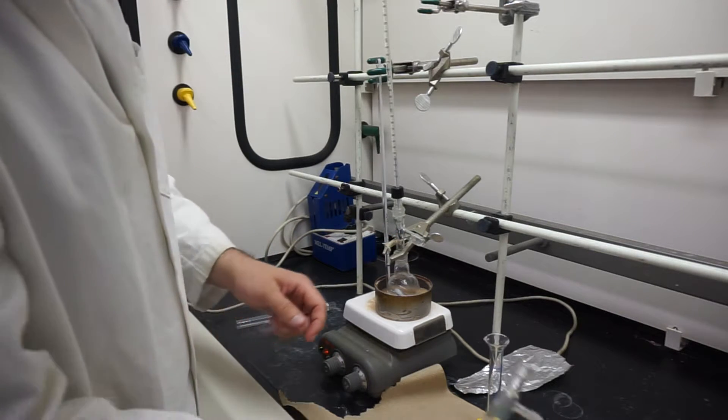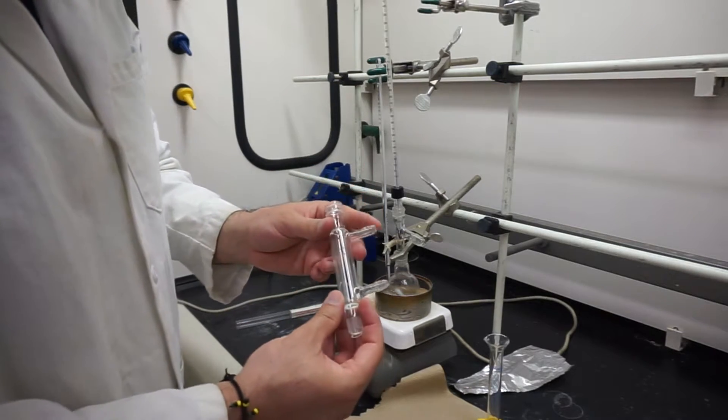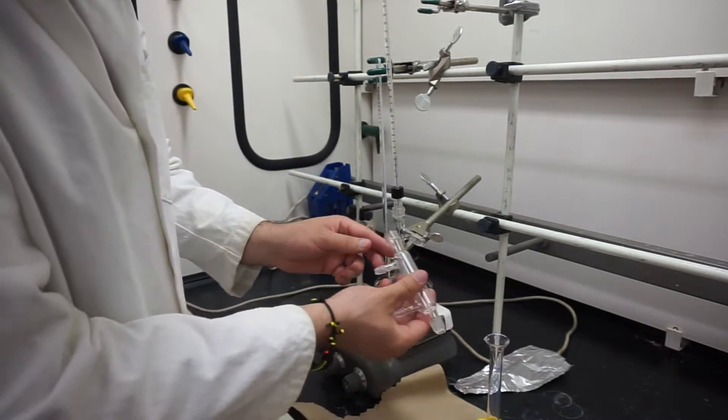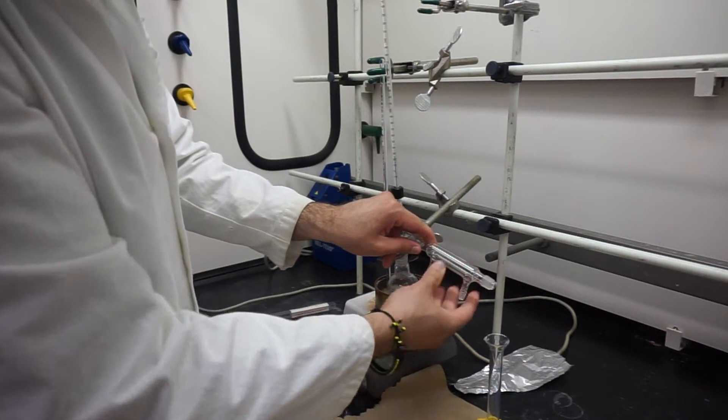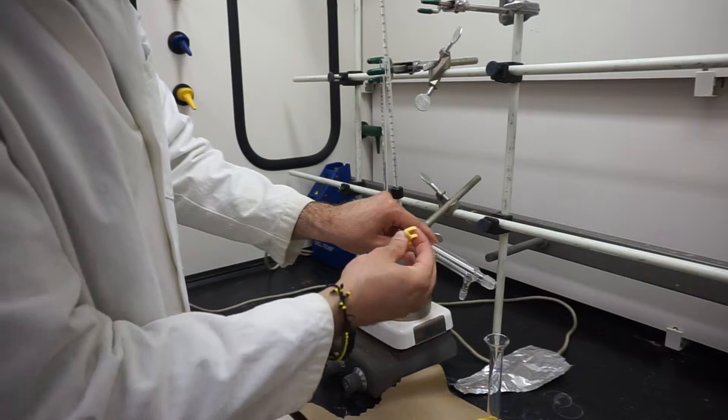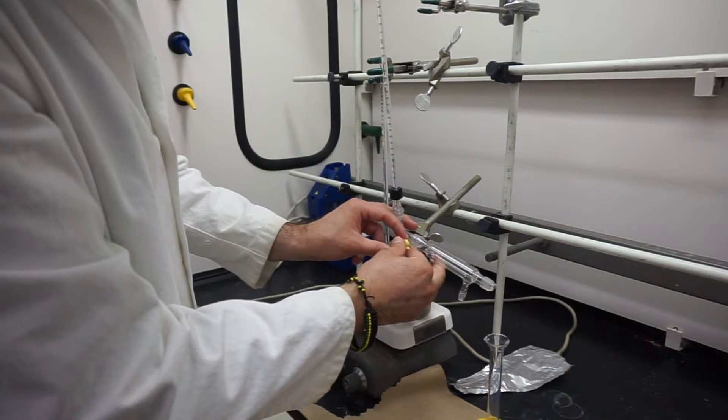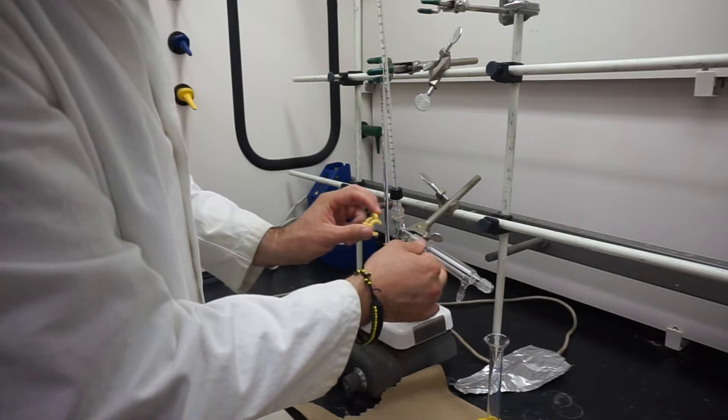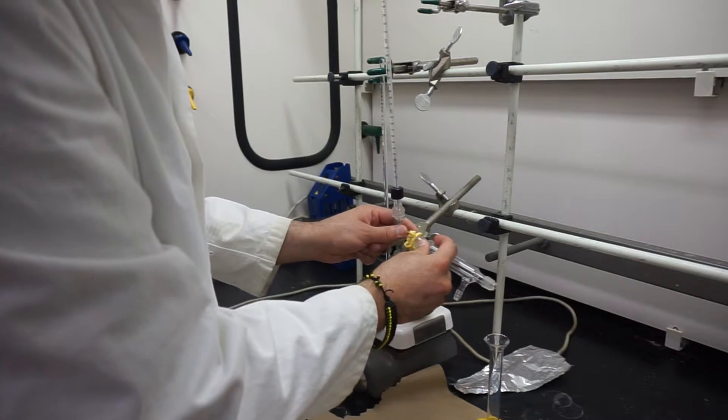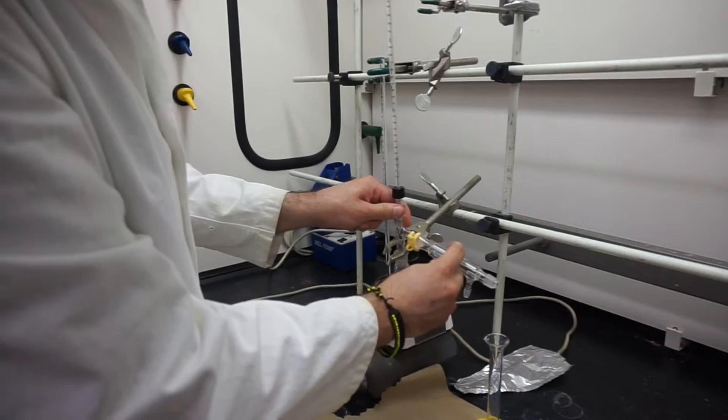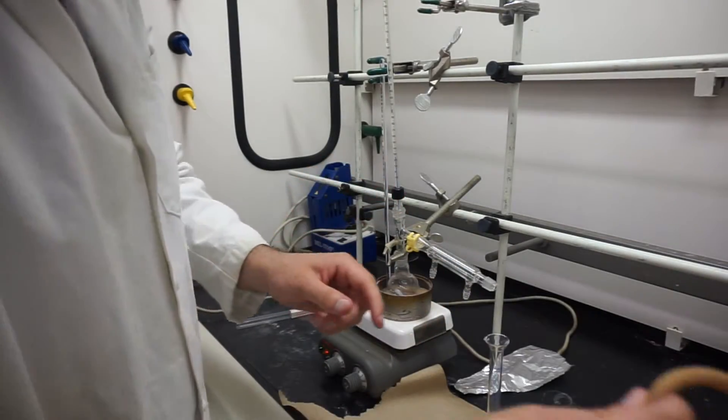We're going to take our water-cooled condenser and attach it at this joint with the nozzles facing down, and we're going to use this Keck clip to help secure it together. We can Keck clip the two pieces together, and it should hold nicely.